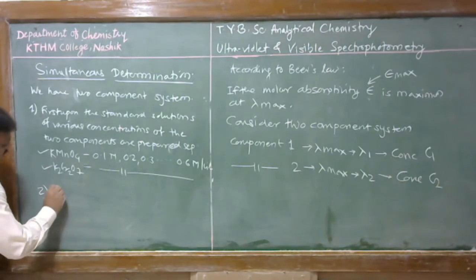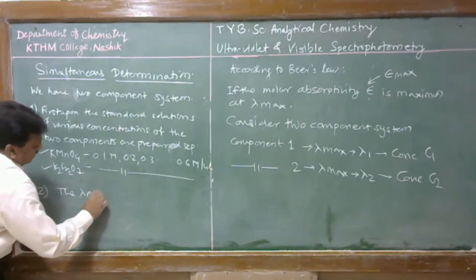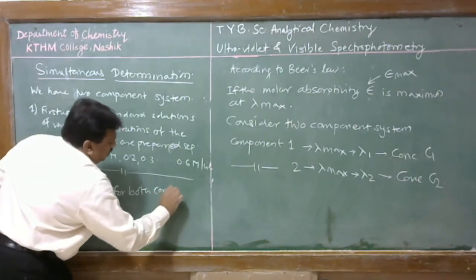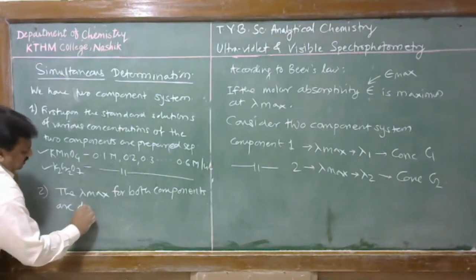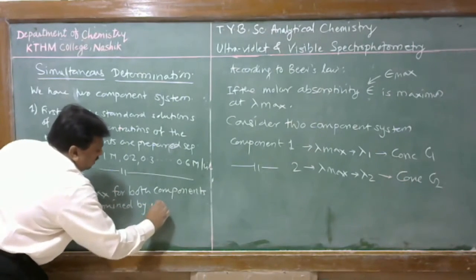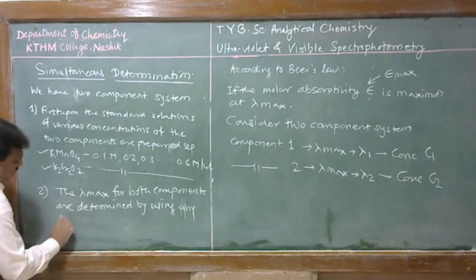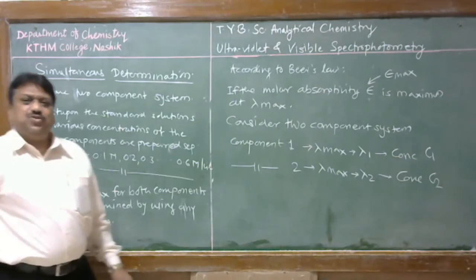The second thing is that after preparation of the standard solutions, the lambda max, that is the wavelength of maximum absorption, for both components is determined by using any one solution, because lambda max is independent of the concentration of the analyte.